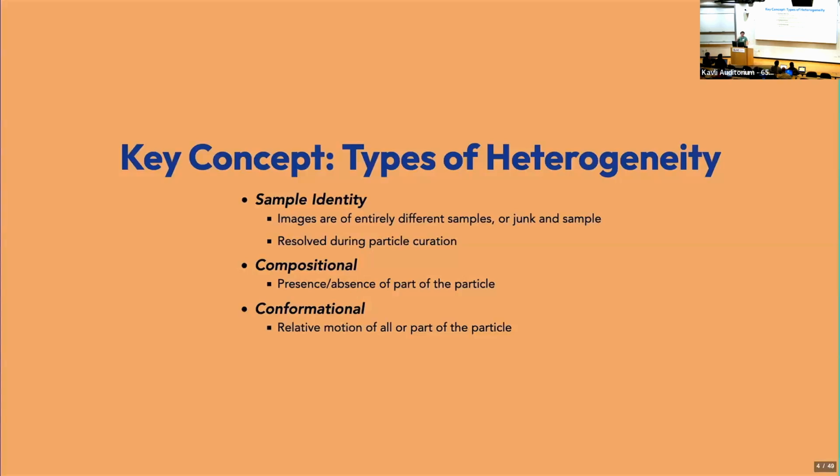Or you might have a situation like we saw in one of the lightning talks yesterday, where you have a fab bound to some domain that's very flexible, right? That would be more continuous conformational heterogeneity, also known as flexibility, right? Where you have this continuous gradient where you have limits, right? There's either up or down, but you are sampling that whole range in between.